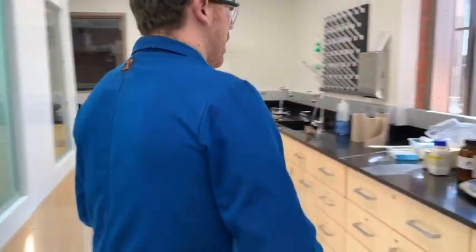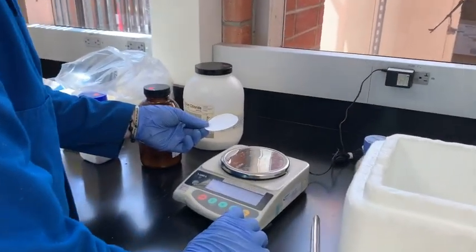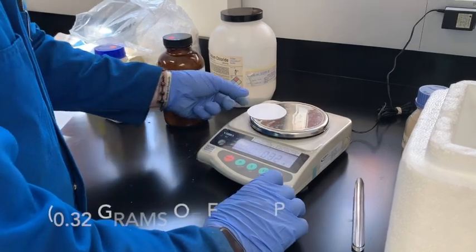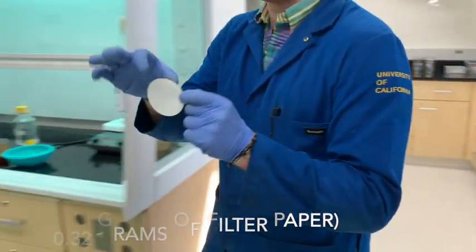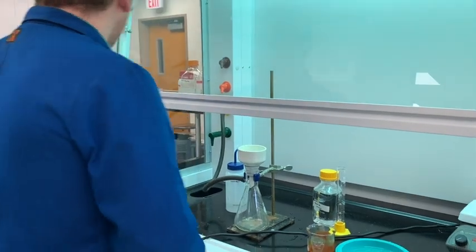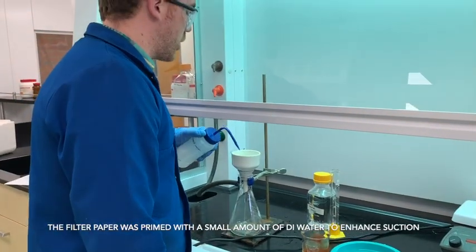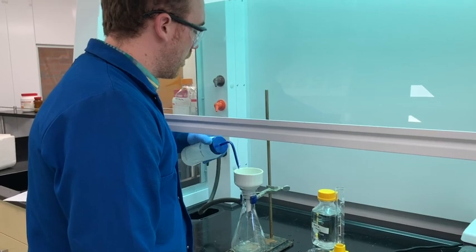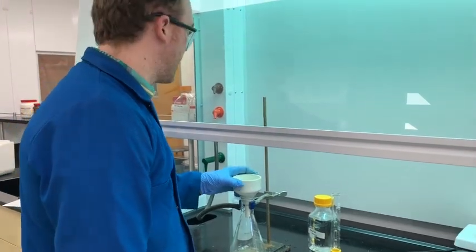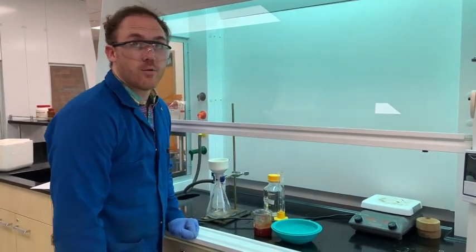So I'm going to just place it on the scale, this is pretty thin, it'll be fine. It's about 0.32 grams, 320 milligrams. And it's a little bit of water that I got from my hand on there. I'm just going to put it in place, turn on the vacuum, and take a little bit of DI water to help improve the suction. So apparently this vacuum is really good. You can actually feel it on your hand a little bit if you cover the top. So that way you know you're ready to go.